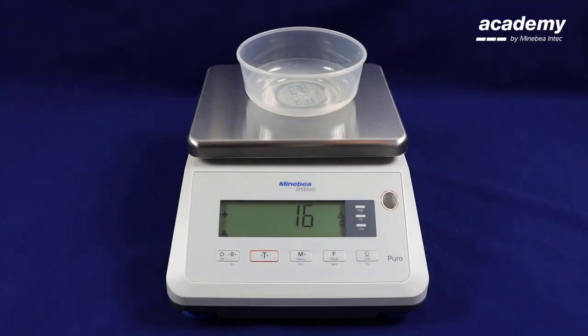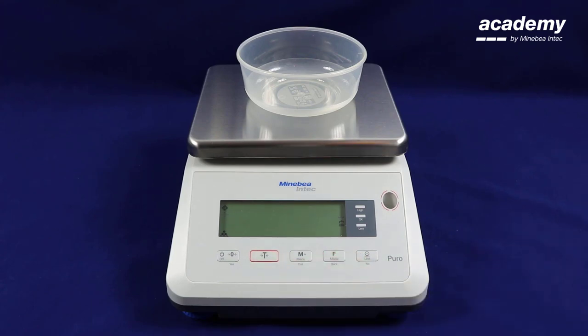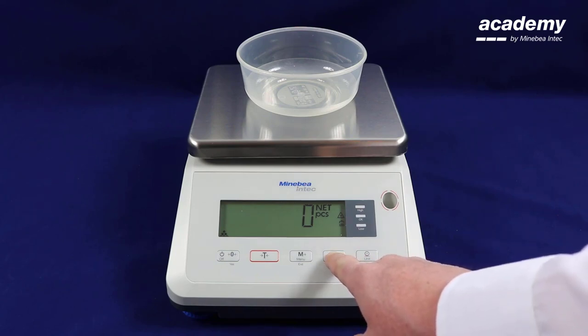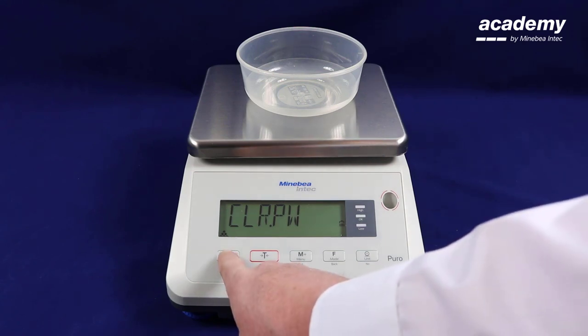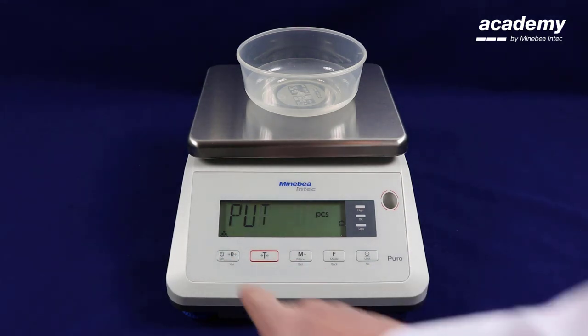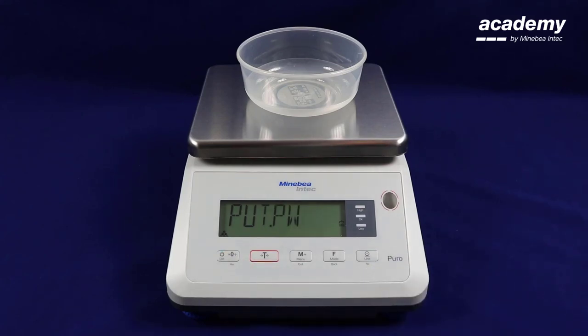Now we will show an example of changing the reference weight. Place the container on the scale and press tare, then hold down the function key. Here it is requesting if you want to change or clear your current piece weights. Press yes to accept, then put the reference number in and press yes to accept.